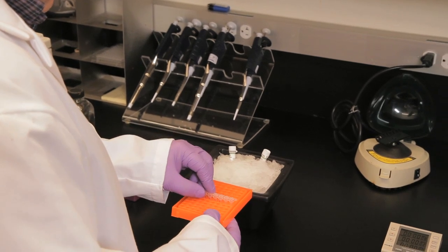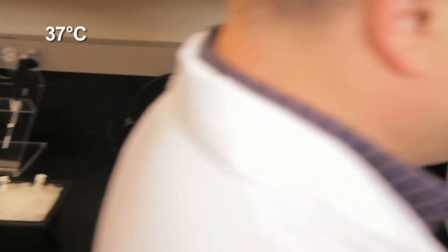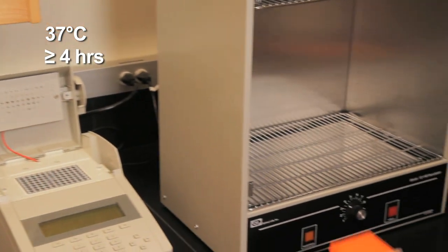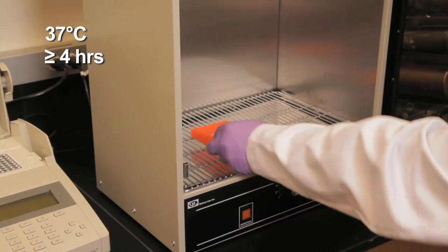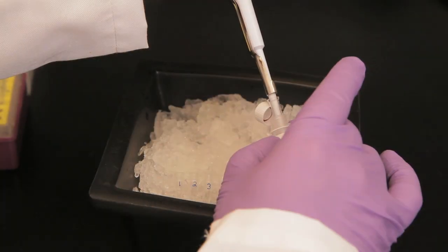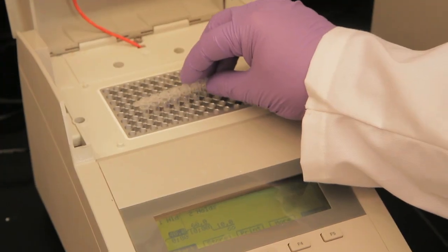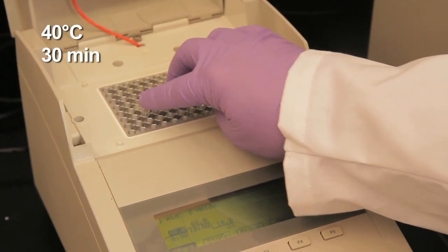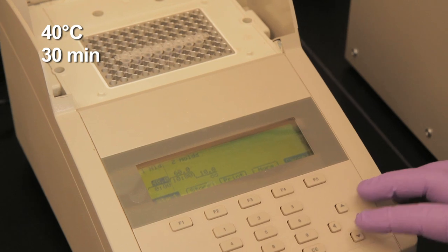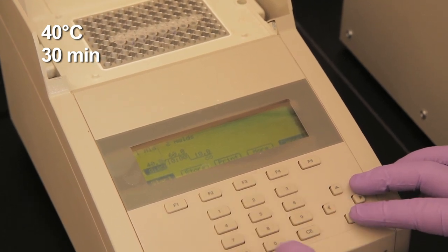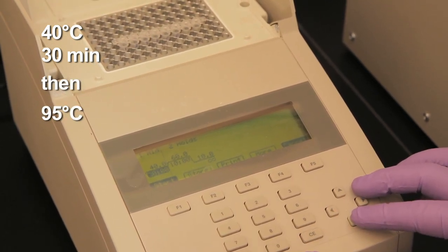Incubate all six tubes at 37 degrees Celsius for at least 4 hours. Then add 1 microliter of Proteinase K into each tube and incubate at 40 degrees Celsius for 30 minutes. Finally, inactivate the Proteinase K by incubating at 95 degrees Celsius for 10 minutes.